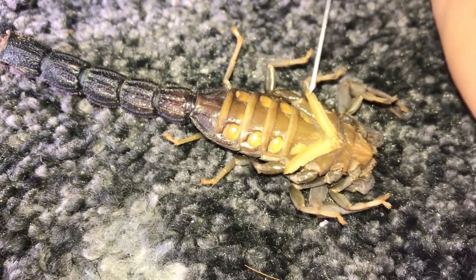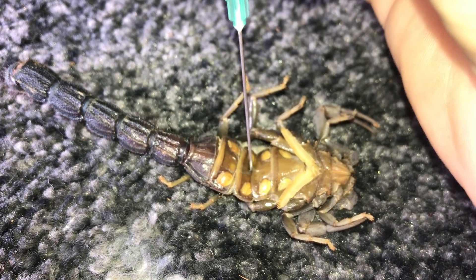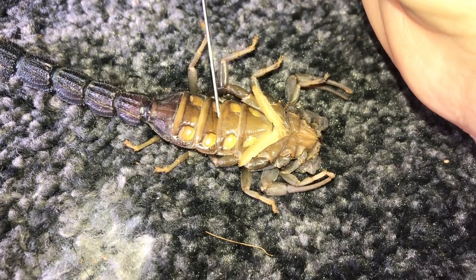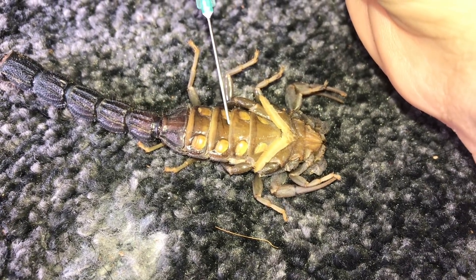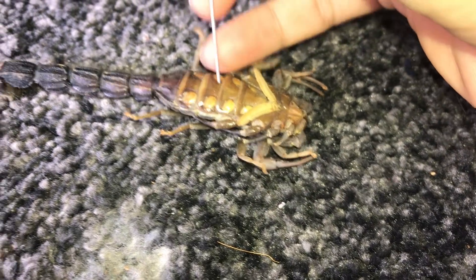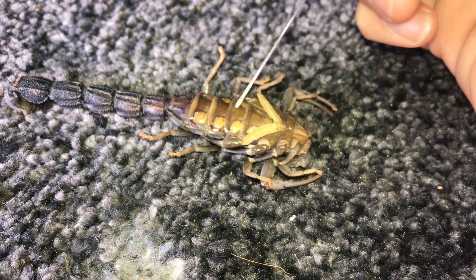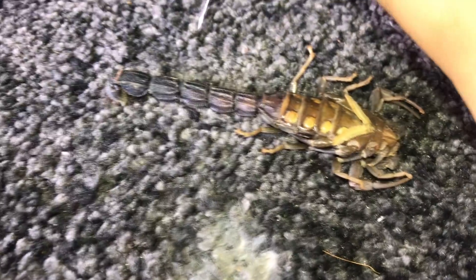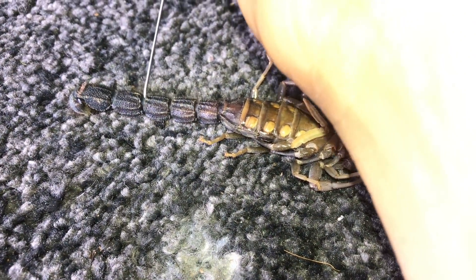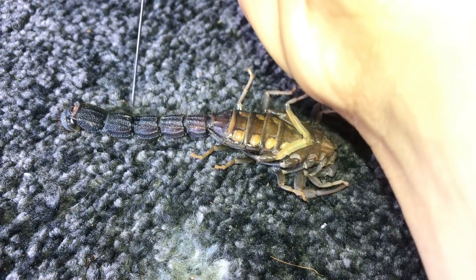I'll poke the needle into the body cavity — it died not too long ago. There we go, needle in, just inject some... you can see it expand. Now I'm not sure if I should inject into the stinger. Let me see if I can poke it in — it's really really solid and it's not easy at all. I think that'll do.